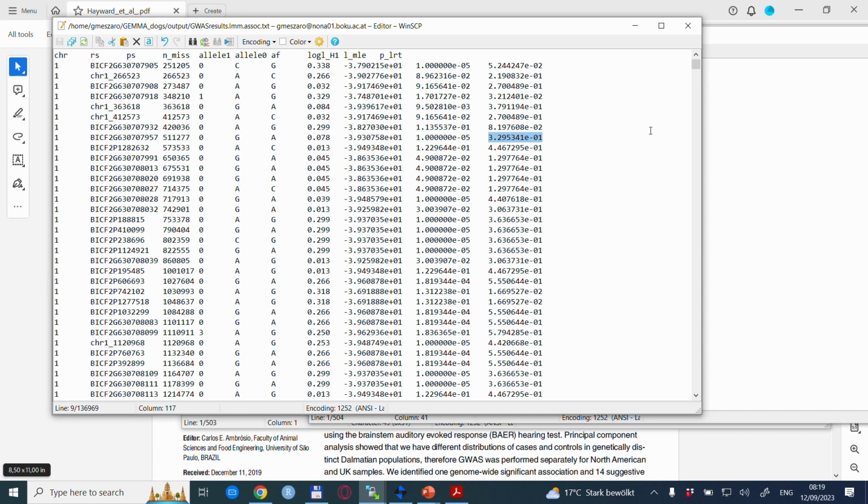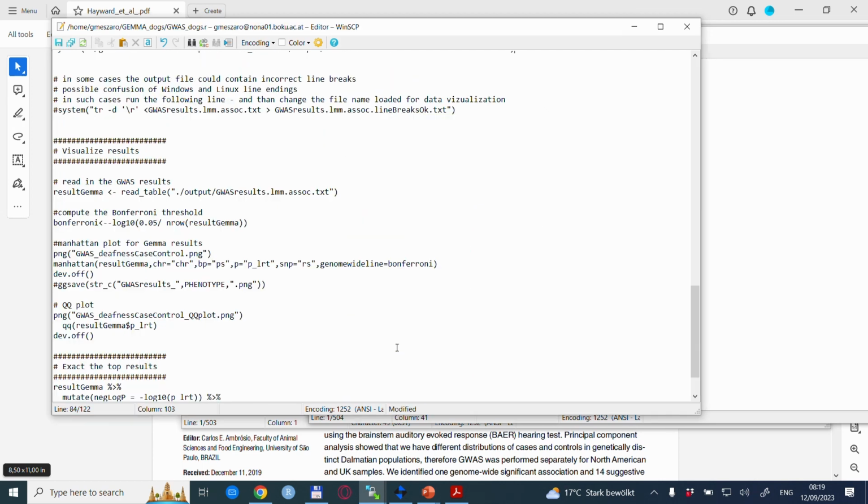Of course, you don't want to look at almost 140,000 lines in this case, but at a nice Manhattan plot, so you can see straight away what's happening. You want to do that by visualizing the results, so this is the next step. Fortunately, we have R, and that can take care of things in a very quick way.